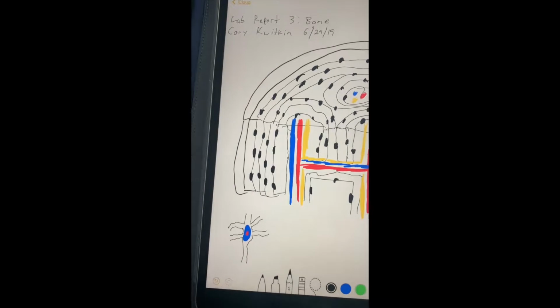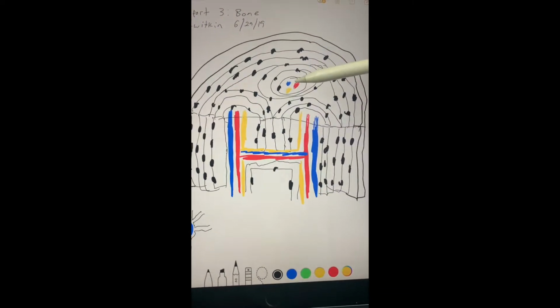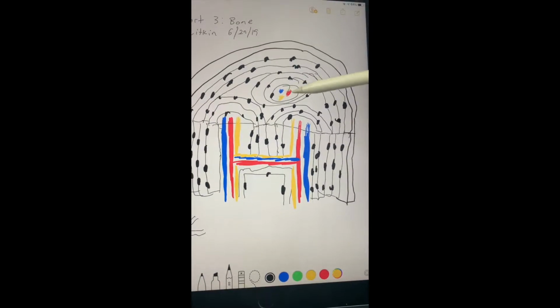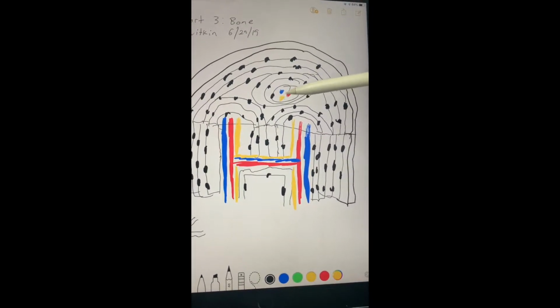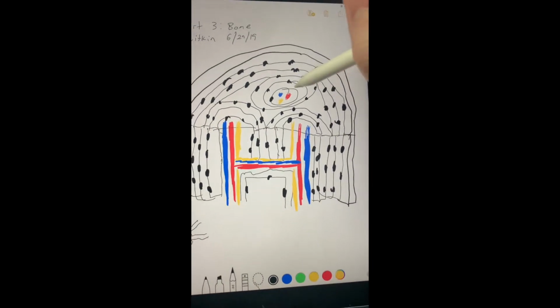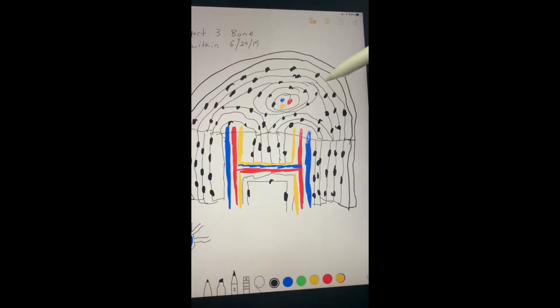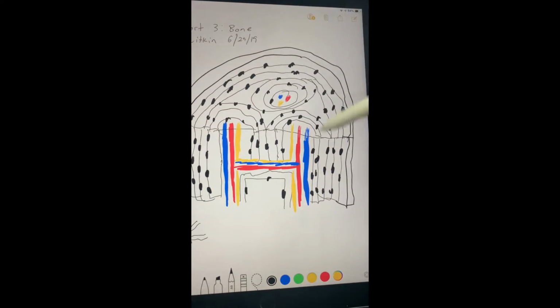And you can see the central canal right here has your vein, your artery, your nerve in here. And then this is your complete osteon, which also has its concentric laminae coming out. So I just drew 3 out there. So there's 3 different ones in here.